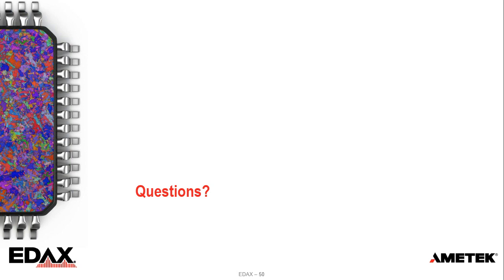And so the Clarity detector is really good for this because there are no phosphors, no lenses, no fiber optics or anything. So you have direct detection.